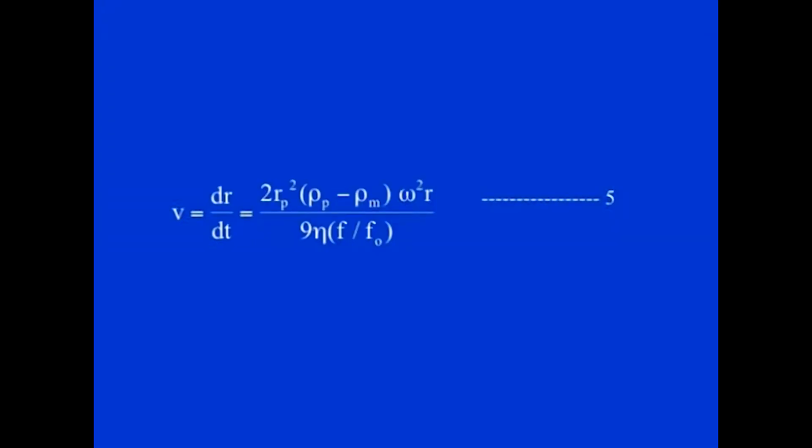So, the frictional coefficient of these molecules has to be compared with the frictional coefficient of a similar sphere, and so the equation will be different from the previous equation we saw for the ideal, unhydrated spherical molecule. The result is that the particle will sediment at a lower rate, and the equation will become this one, where you have to add another factor, the frictional coefficient of the elongated or non-spherical molecule compared to that of a sphere.